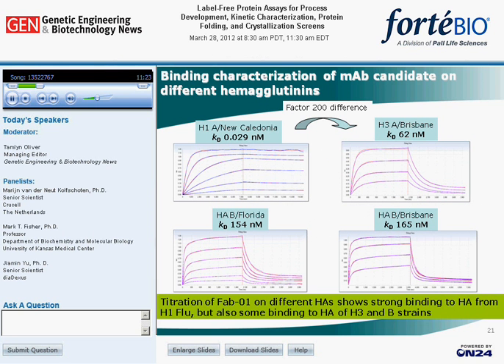In this way, binding properties of antibody candidates to a large panel of HA molecules from different influenza strains have been assessed. In this slide, an example is shown of lead candidate antibody 01. It shows broad binding specificity to different flu clades.